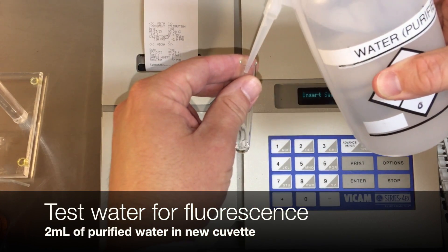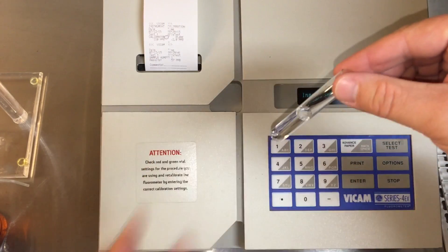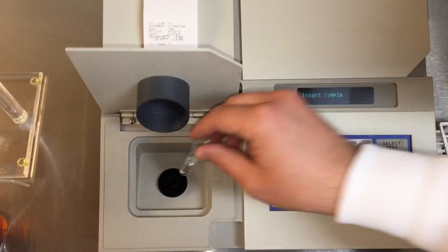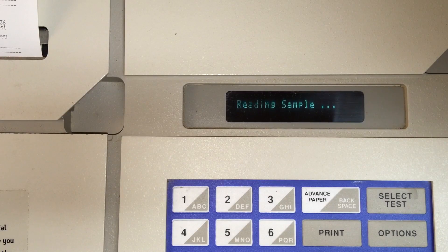All reagents depend on clean, purified, non-fluorescent water. Pour or pipet 2 milliliters of water into a new cuvette and insert into the fluorometer to test. After 60 seconds, validate that the result is zero. If not, seek a new source of purified water.